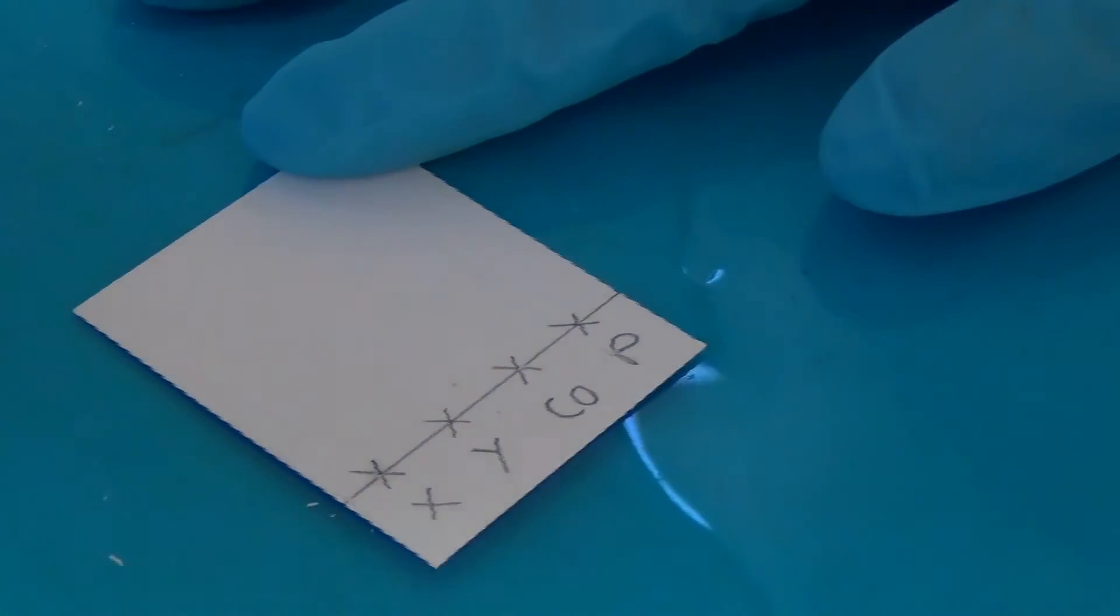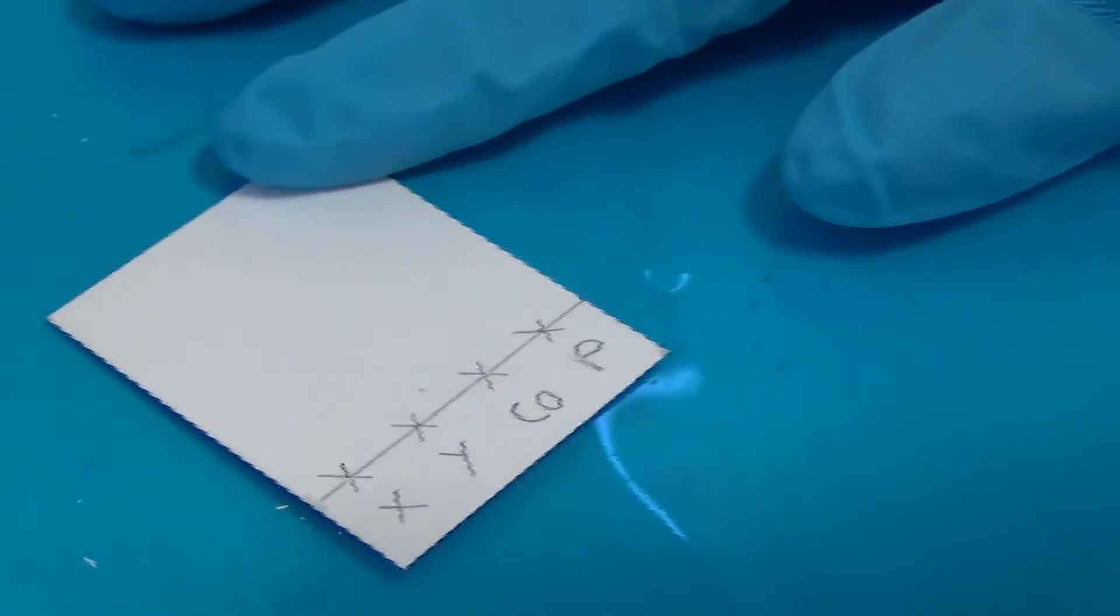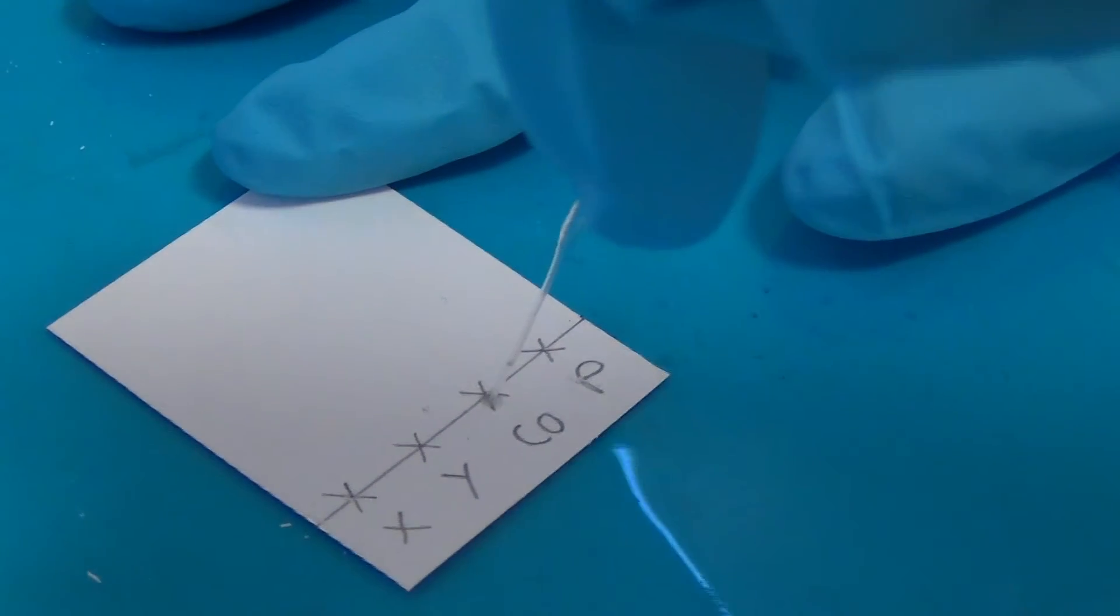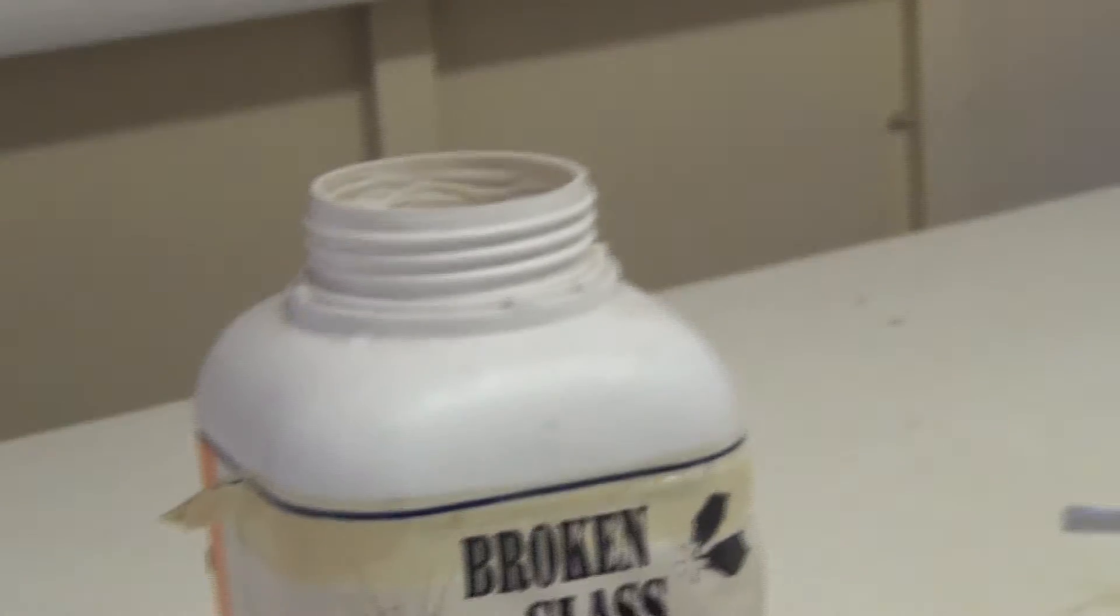This is the co-spot where you will spot all three samples on top of each other, and the results of the co-spot will act as a useful reference when analysing the plate. When finished with the capillary tube, make sure to dispose of it in a suitable place.